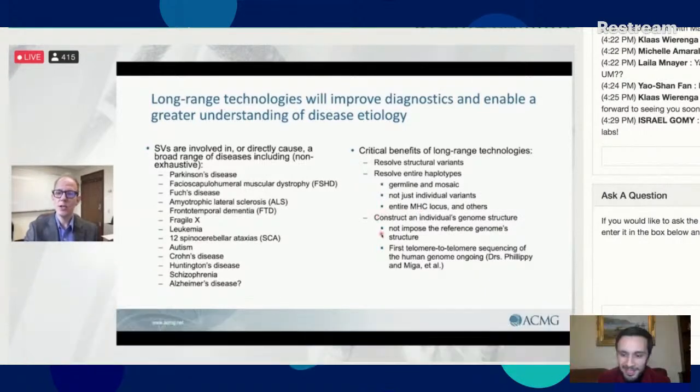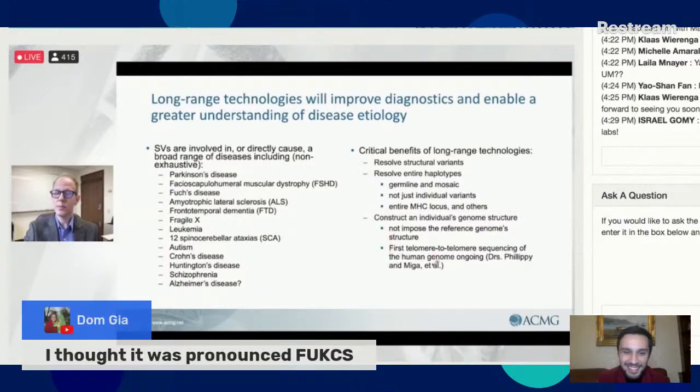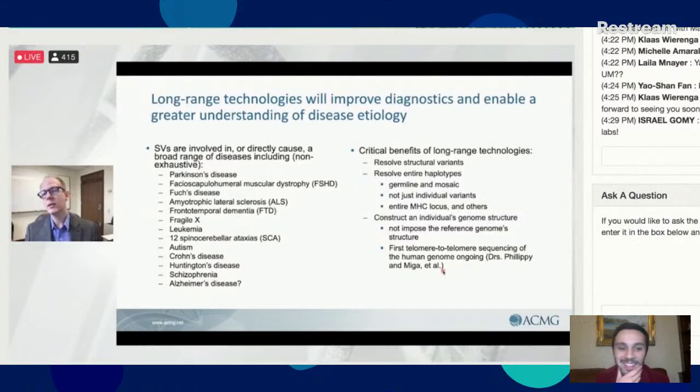Also using these technologies, Drs. Phillippy and Miga et al. have done the first telomere to telomere sequencing of the human genome. They published the X chromosome. They have more coming. It's really remarkable. And they used all of these technologies that I've been talking about today.